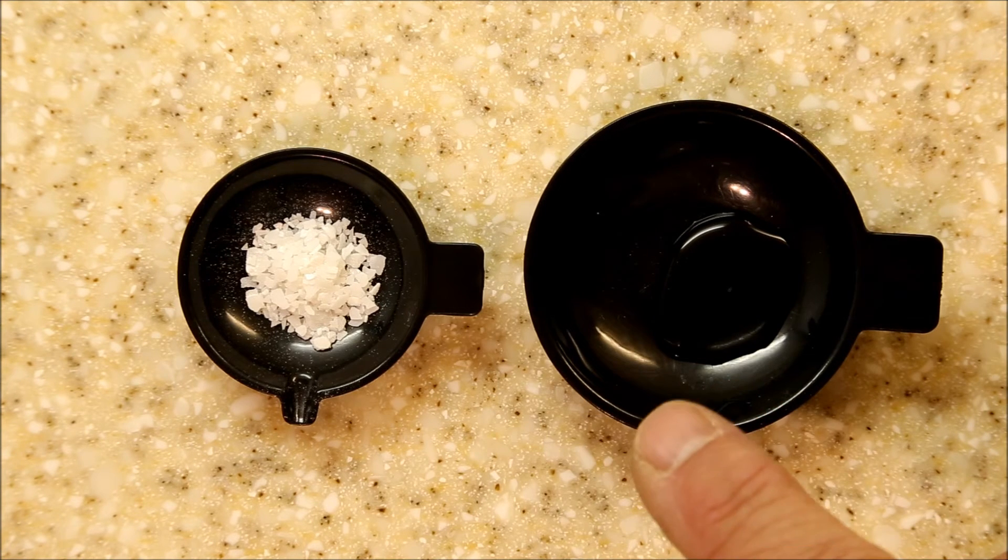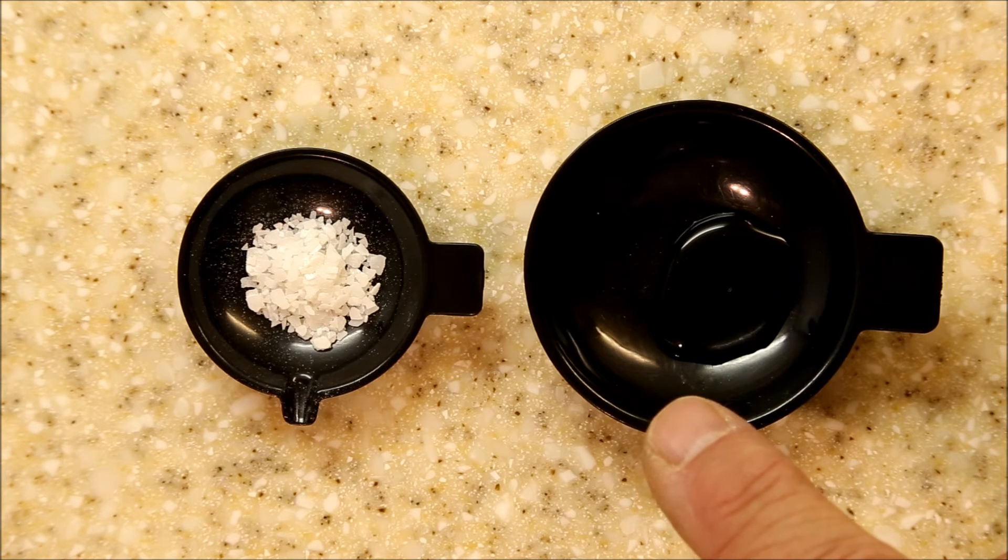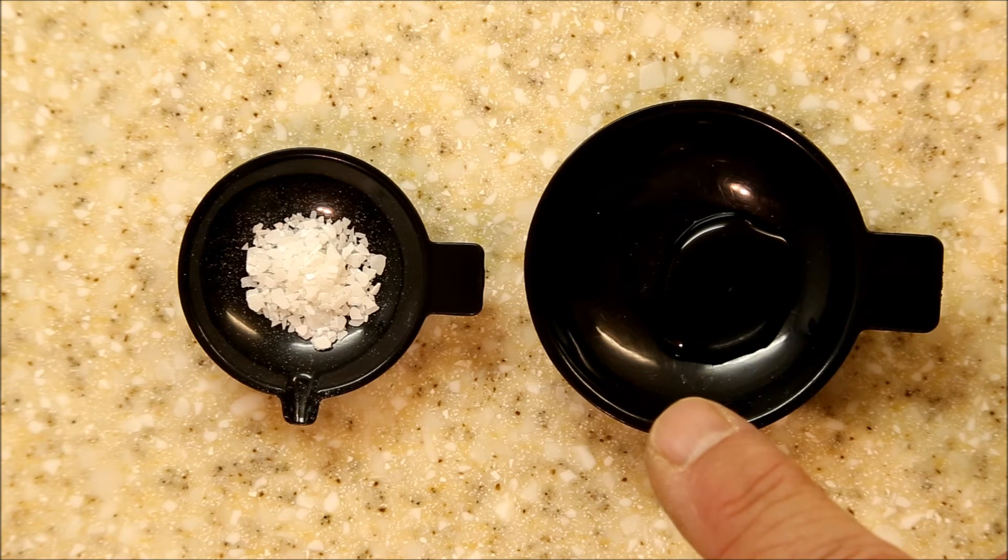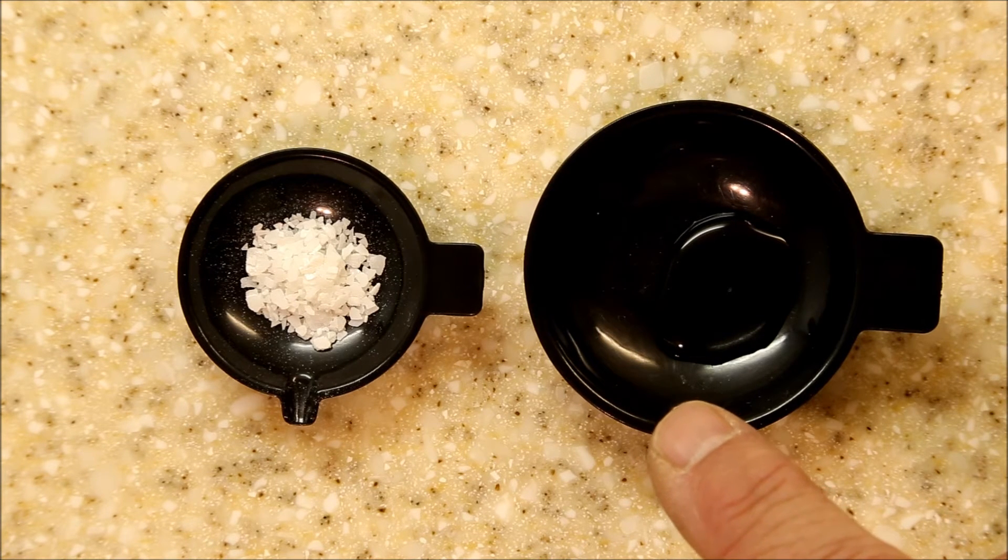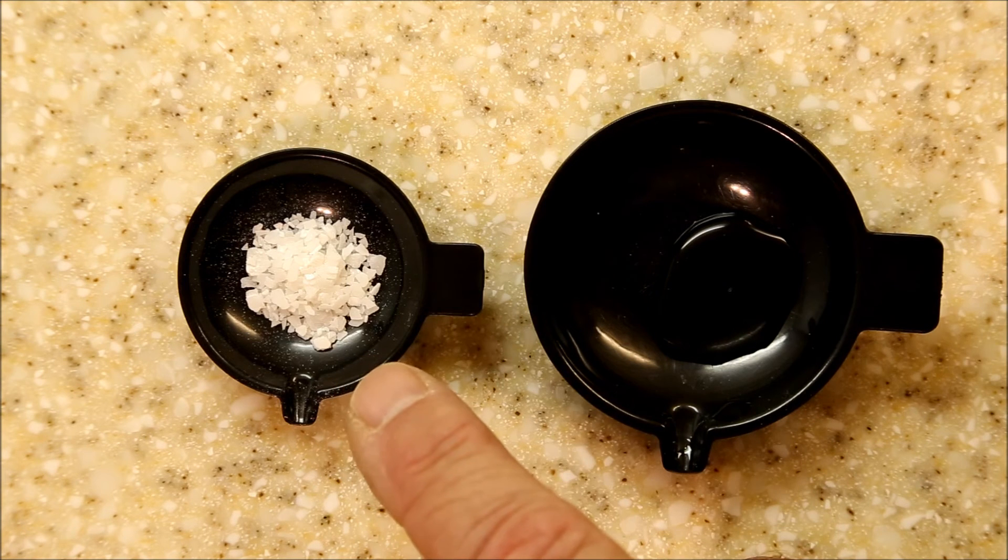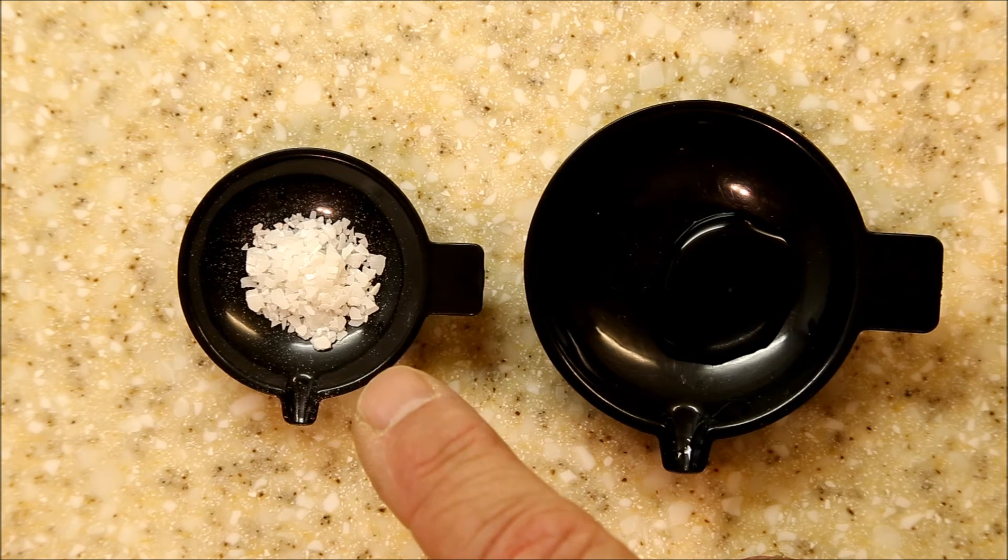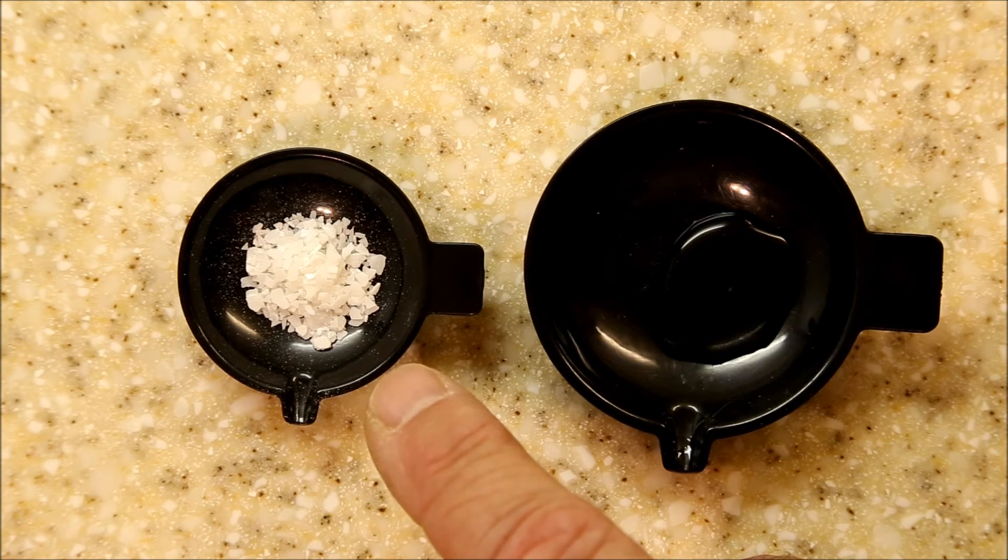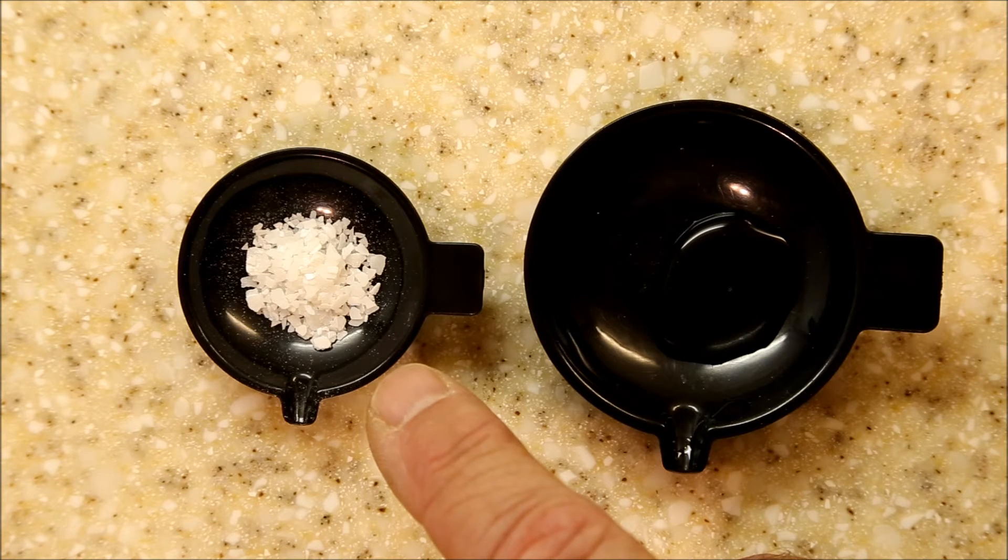The stannous chloride doesn't dissolve in the water real easily, so you'll want to add both in a glass container and then use a glass swizzle stick or something non-reactive to help pulverize the stannous chloride into a fine powder and mix it in and get it dissolved into the water.